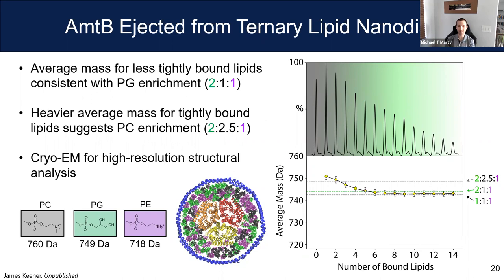these sort of studies. And I would not have predicted from the beginning that we could really see exactly what's happening. But I think it gives you a more nuanced picture of what these lipids look like around the protein. It's not just certain lipids and certain binding sites. It's much more about maybe a continuous sweeping of different specificities, right? We have different sorts of specificities in different sites, and it's often not perfect, you know?